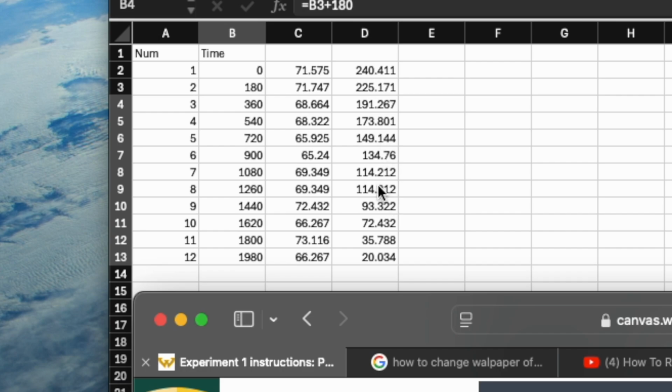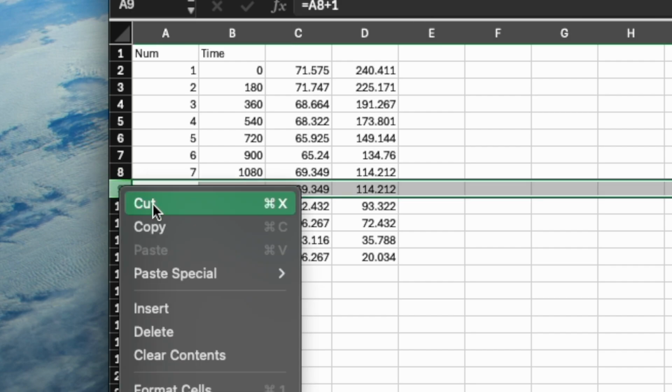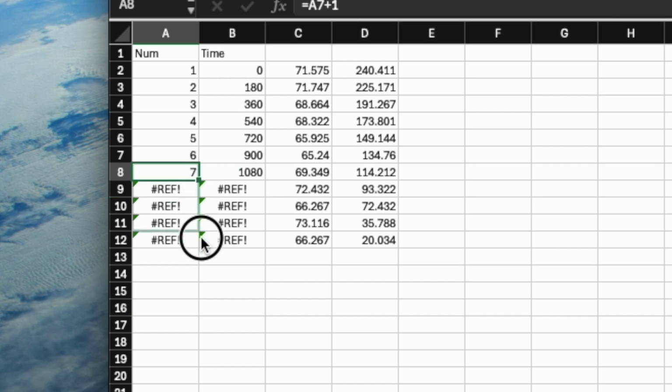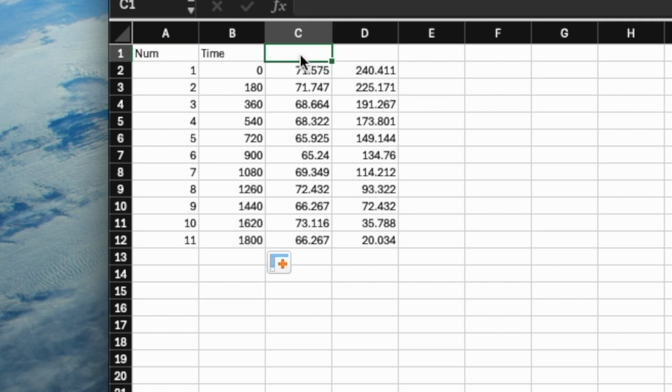Oops, here I have clicked one particle double here, so we just want to remove this one. So you're going to drag it down here to here, and drag it down here like that. Okay, you're good now. So this is X, this is X, this is Y. So this should be displacement R.